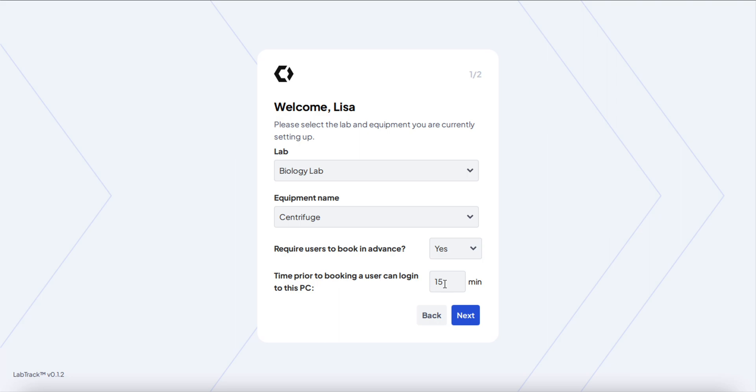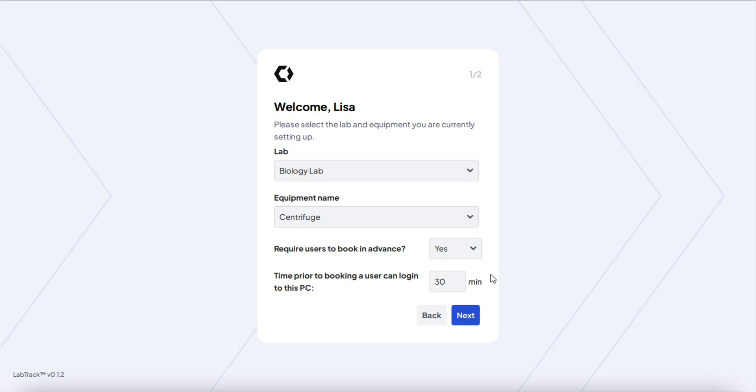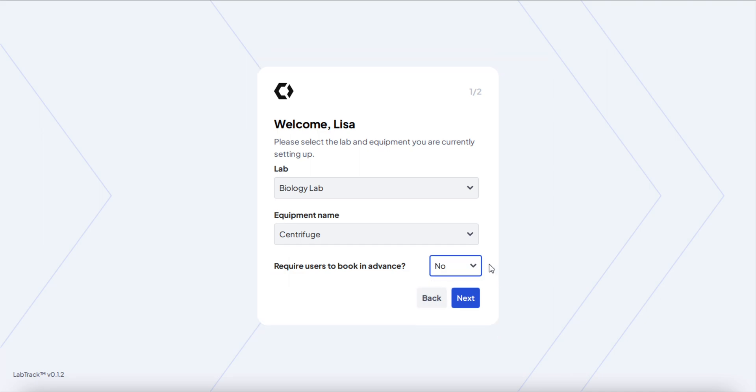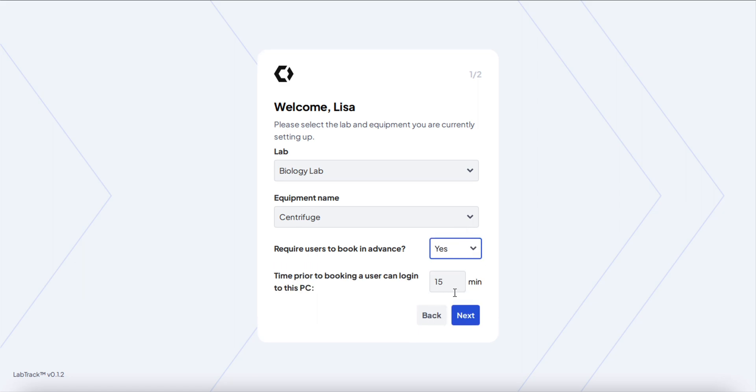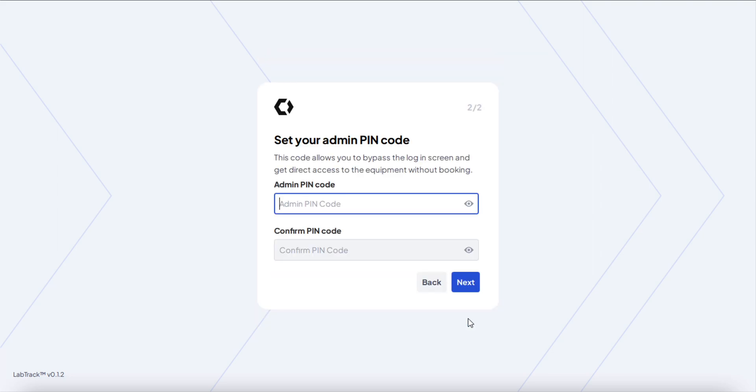In this case, in the next 15 minutes, whenever a user tries to log into the desktop app to use the PC and the instrument, they need to have a booking within the next 15 minutes. You can change this to the next 30, for example. Or if you don't require people to have a booking, just say no and click next. Those are the two modes: no and yes. If you say yes, you can define the time window.